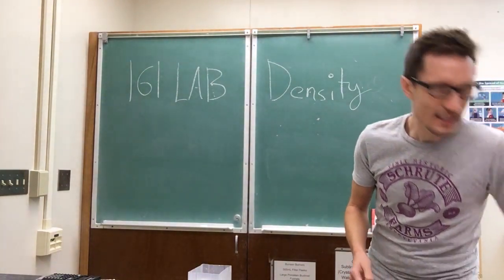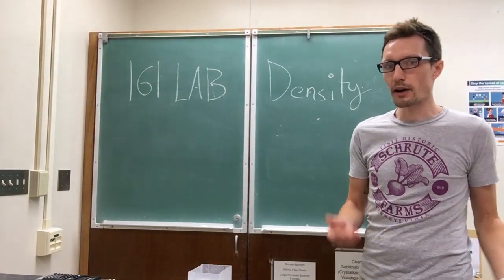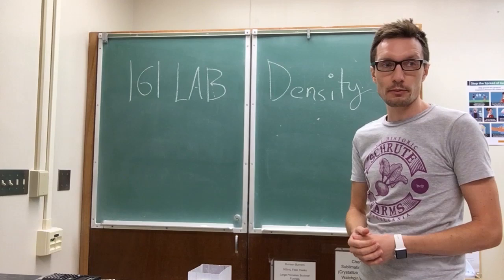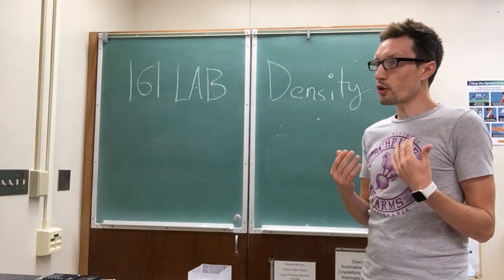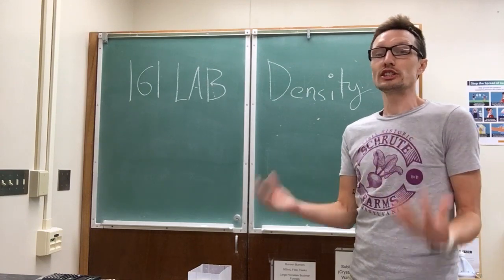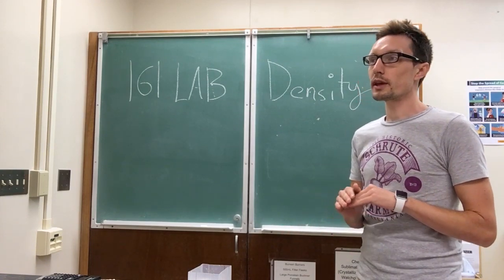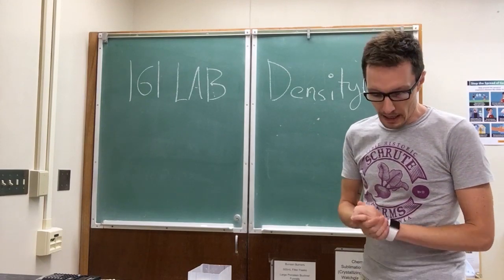Since it's going to be so short, I thought maybe what I should do is include some calculation portion for the video. This is something I do for my students when I teach this lab in person, because we're kicking off 161, and although we're teaching you chemistry, we are also kind of teaching you how to science in general. And since we're starting things off at that ground level, we want to make sure you're up to speed with some of your basic algebra and mathematics.